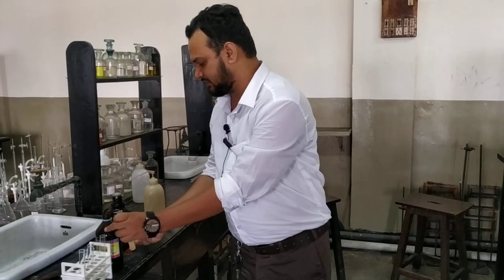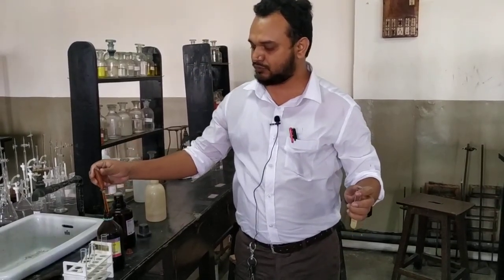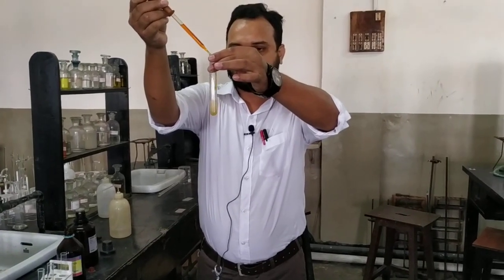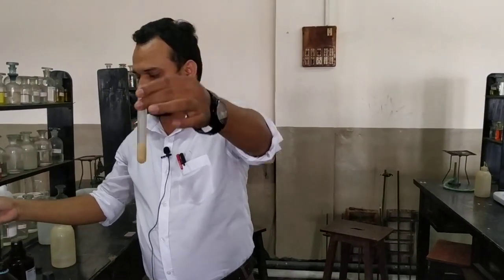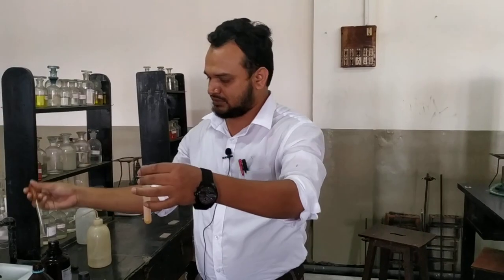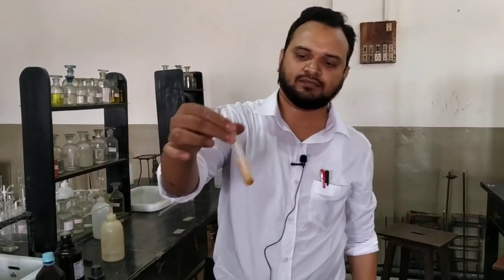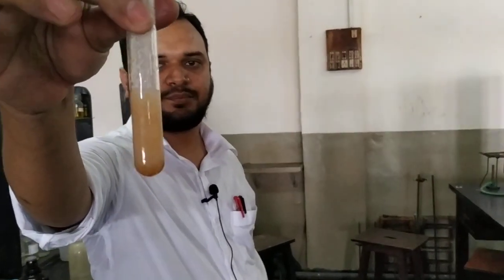water. This bromine water will be supplied to you during your exam, but be very careful while dealing with bromine water because this is highly corrosive in nature. So here we are adding, see, it immediately gives the precipitate. If I add a little more amount, this is a pinkish white precipitate. Here is your precipitate, pinkish white.